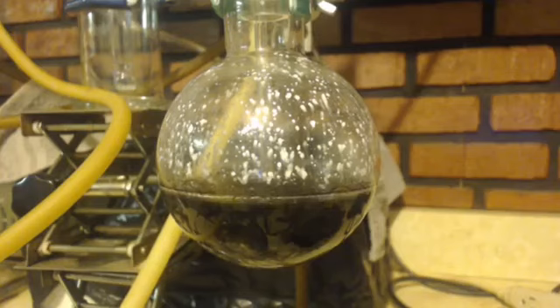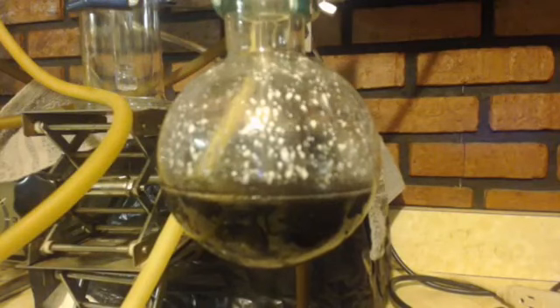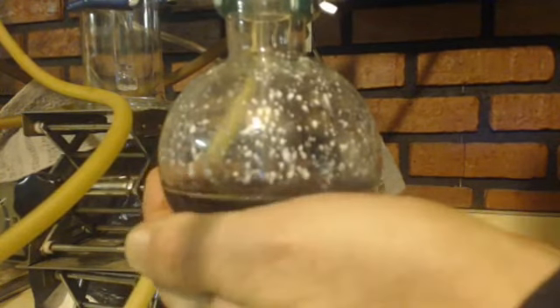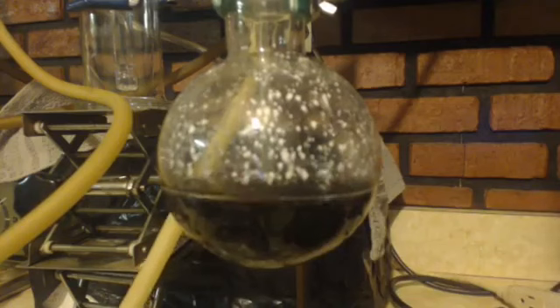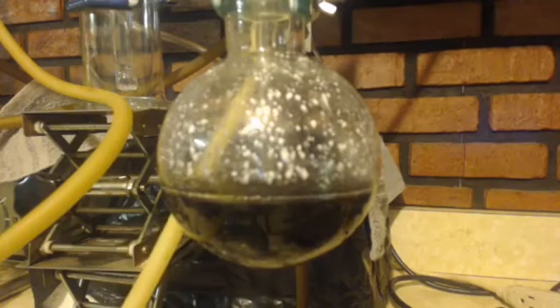Been about 45 minutes or something. You can see it's 36 degrees. It's actually 36.6 Celsius. So this must be slightly exothermic, adding this CO2. So I'm not going to reflux it at the end, like I said I was going to do. But I wanted you to notice something here. Look at all these little spots and stuff on here. See that? They're getting thrown up by the refluxing.